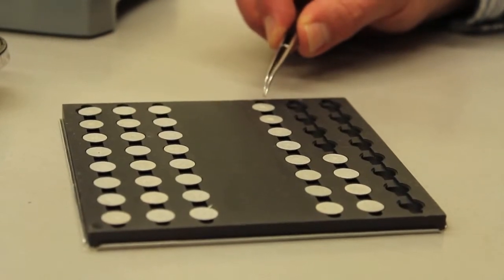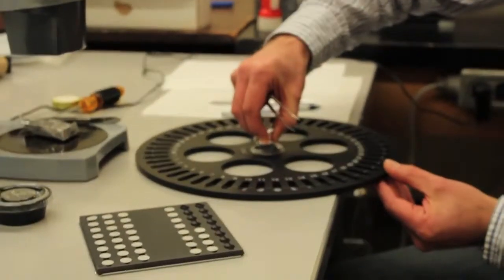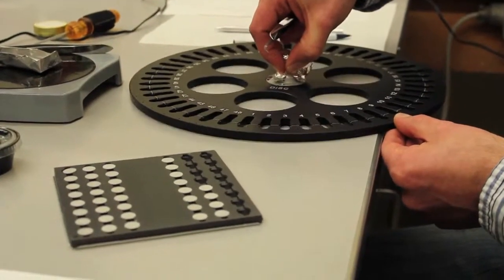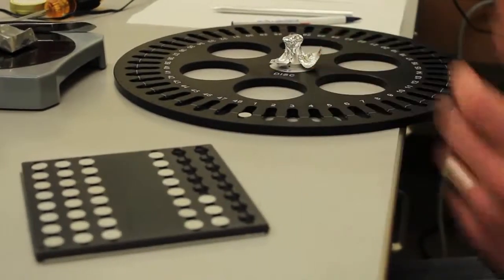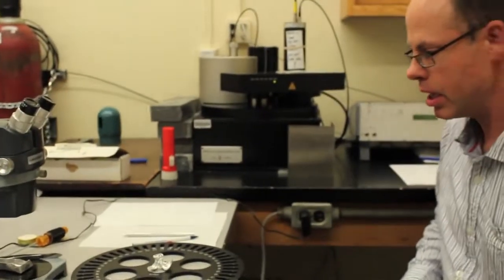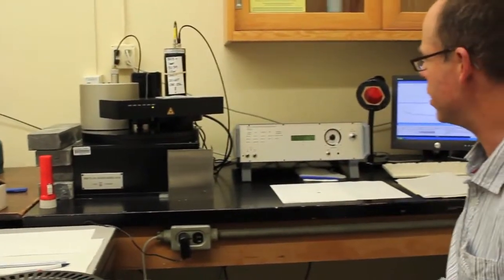we've stuck them onto these aluminium discs. The aluminium discs we place on a holder, such as this. So perhaps I'll just put one in position to illustrate the way that we would do that. So we take one of the samples, put it on the holder, and the holder goes inside this machine behind me. The whole thing there is controlled by this computer off to the side.